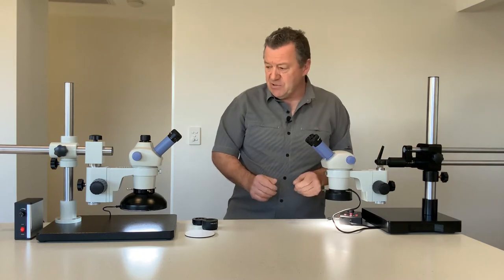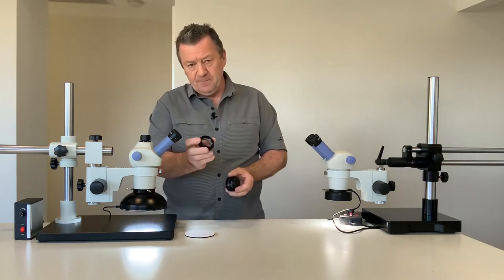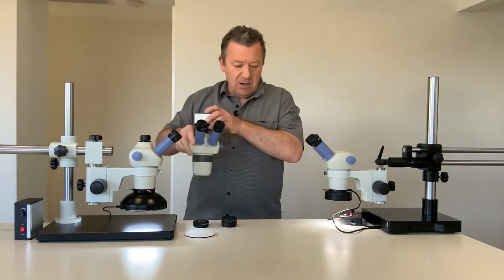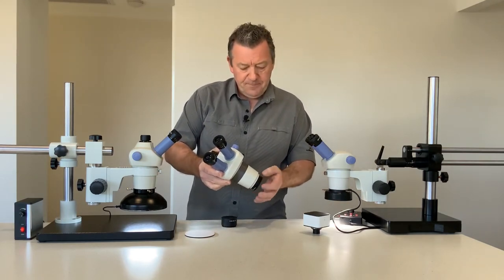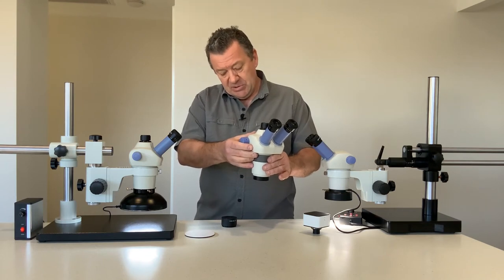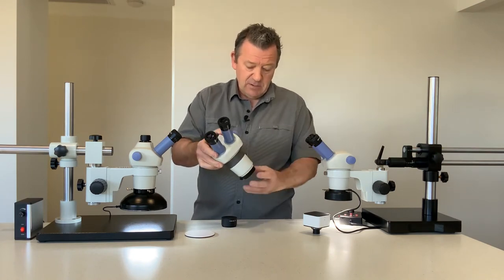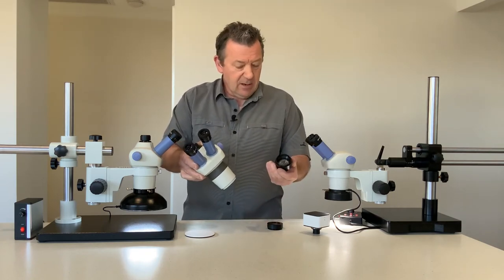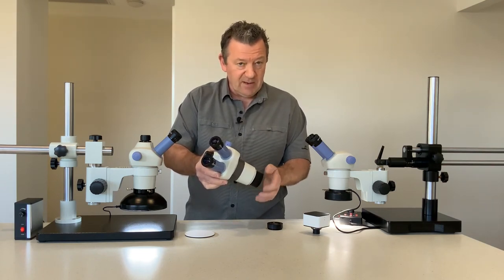For your stereo zoom setups we also have optional Barlow lenses: the 0.5x Barlow lens and the 2x Barlow lens. These simply screw onto the underneath of your microscope. The 0.5x reduces your magnification to 5 times to 22.5 times but doubles your depth of field. The 2x Barlow lens doubles magnification up to 90 times but reduces your working distance by 50 percent.